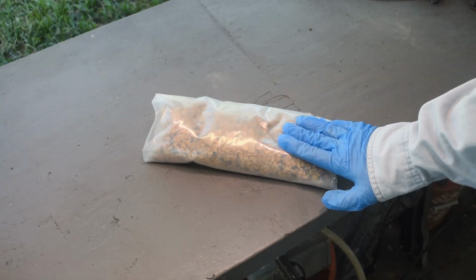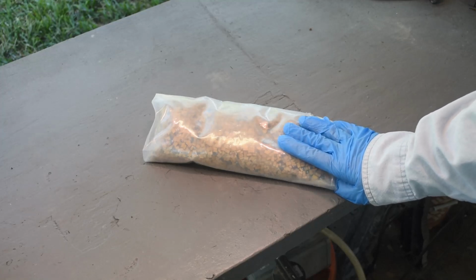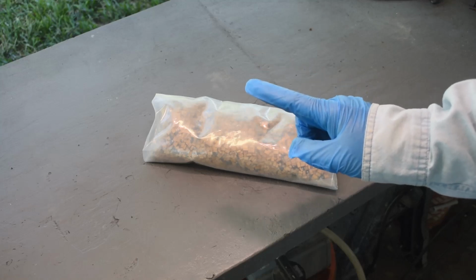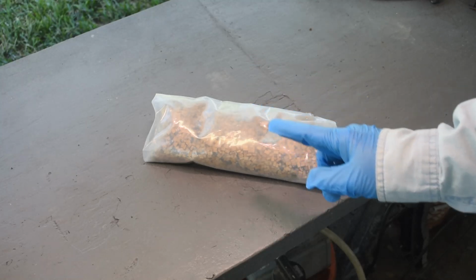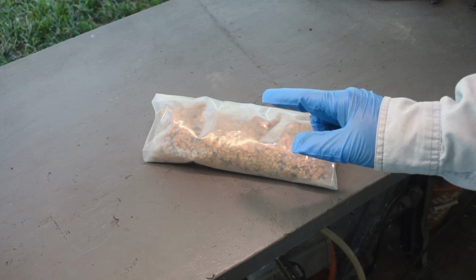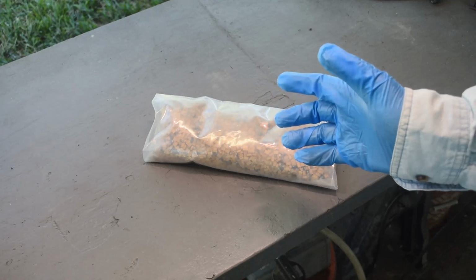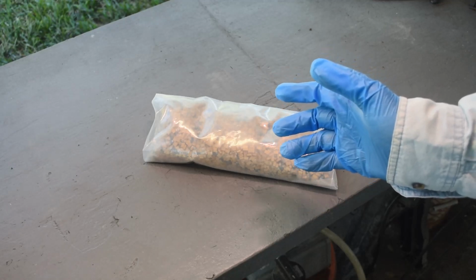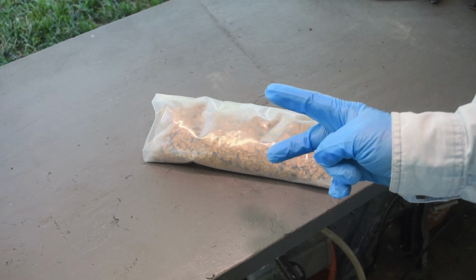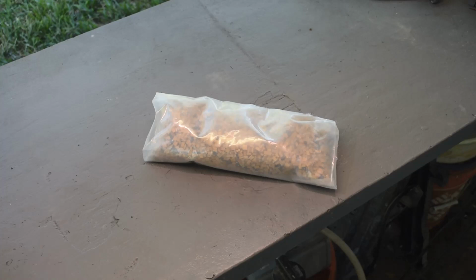You guys had some good ideas in the comments. Maybe I should use muriatic acid up front to digest the iron instead of nitric acid, and that's not a bad idea. That will produce soluble iron compounds. I won't have that nasty, rusty precipitate. And I got to thinking myself that I could try sulfuric acid. And that might get rid of the iron. Again, make nice soluble iron compounds, no rusty precipitate. So what I might do is split this into two different batches and try it both ways and see which works better.